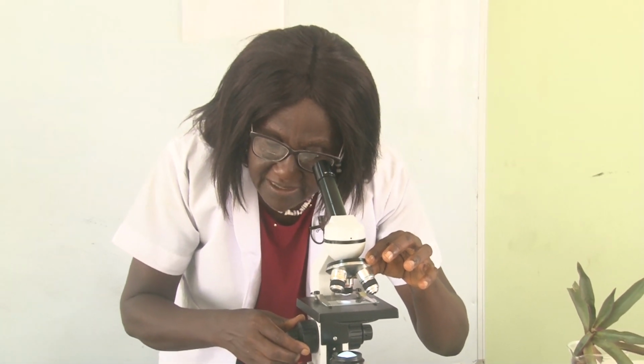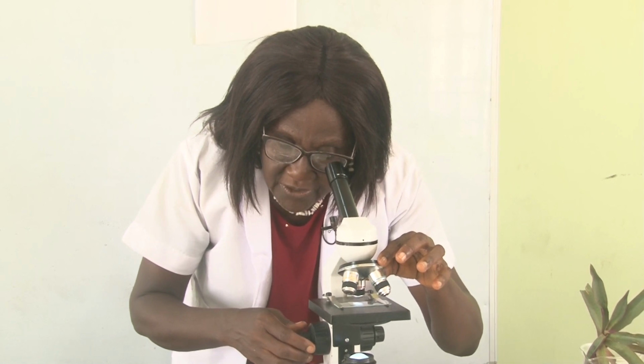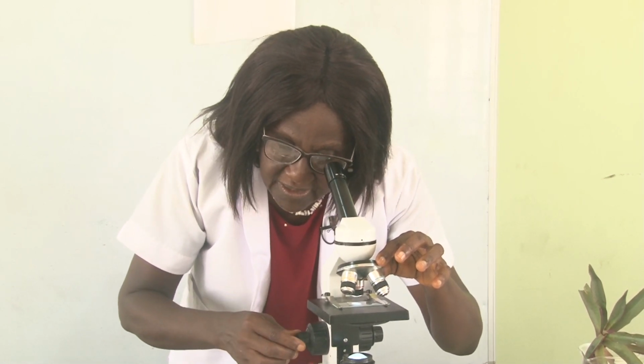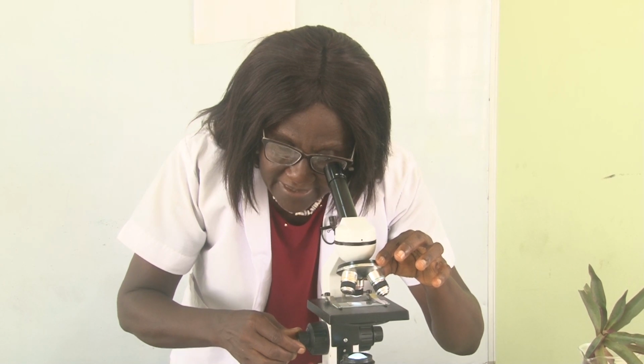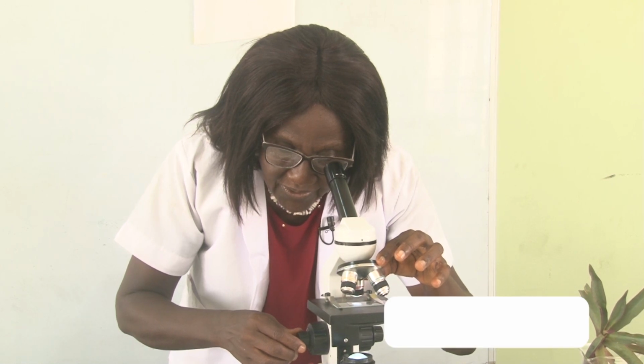When you see the image in focus, you can then use the fine adjustment to bring the image into a sharp focus. Right. So this is where we will end for today.